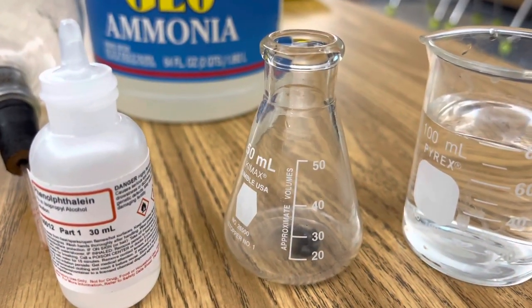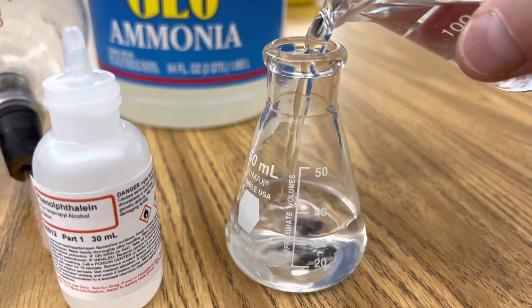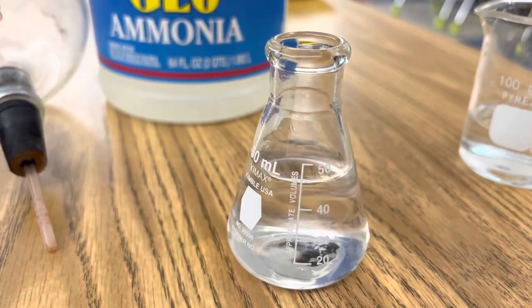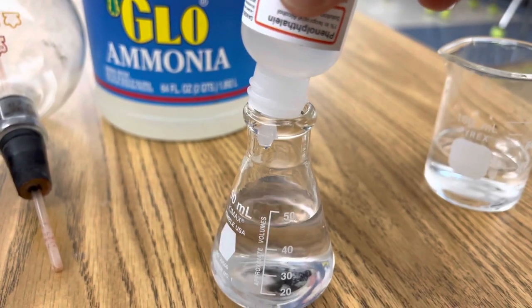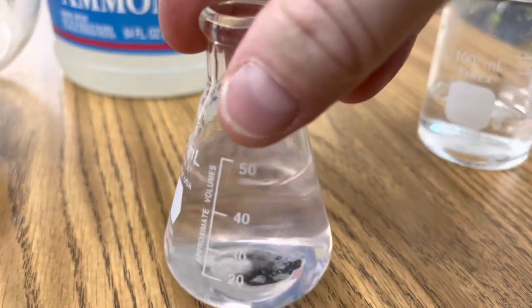Start by adding some distilled water to your lower flask, then add a few drops of phenolphthalein and notice the color of your solution. Here's a few drops of phenolphthalein — this is my indicator — and I'm just going to swirl it around a little bit.